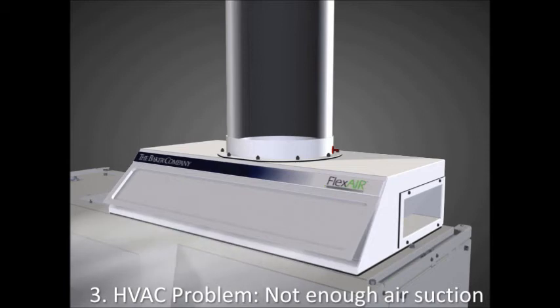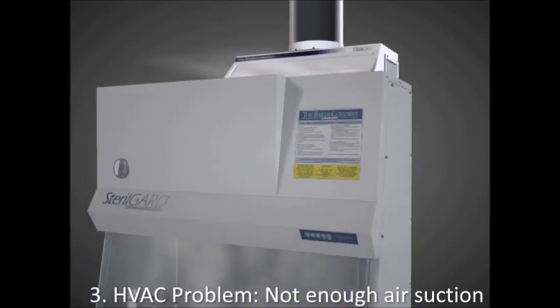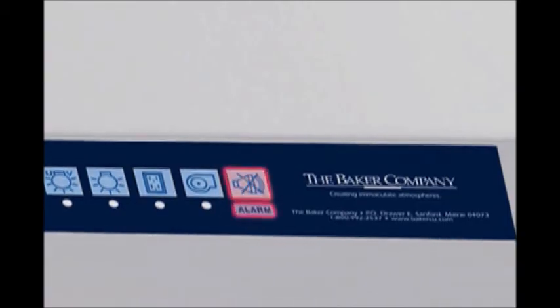If there is not enough suction and the building exhaust system does not exhaust a sufficient amount of air from the cabinet, the outlet damper on the front will open and let air escape. The cabinet will maintain standard operating conditions, and an alarm will sound notifying the worker, ensuring personnel protection.